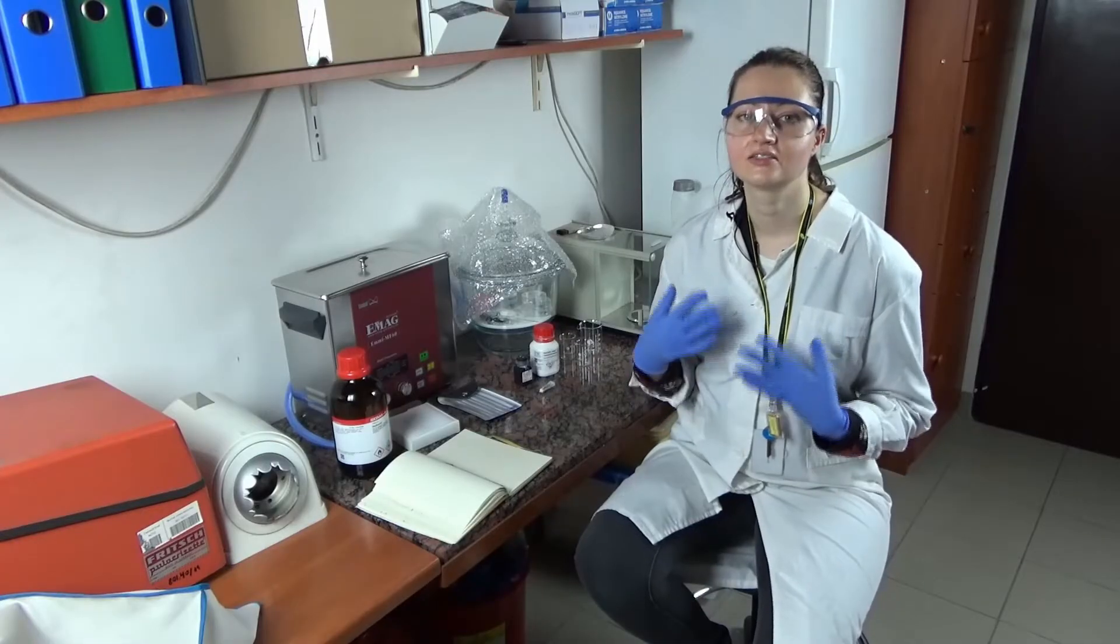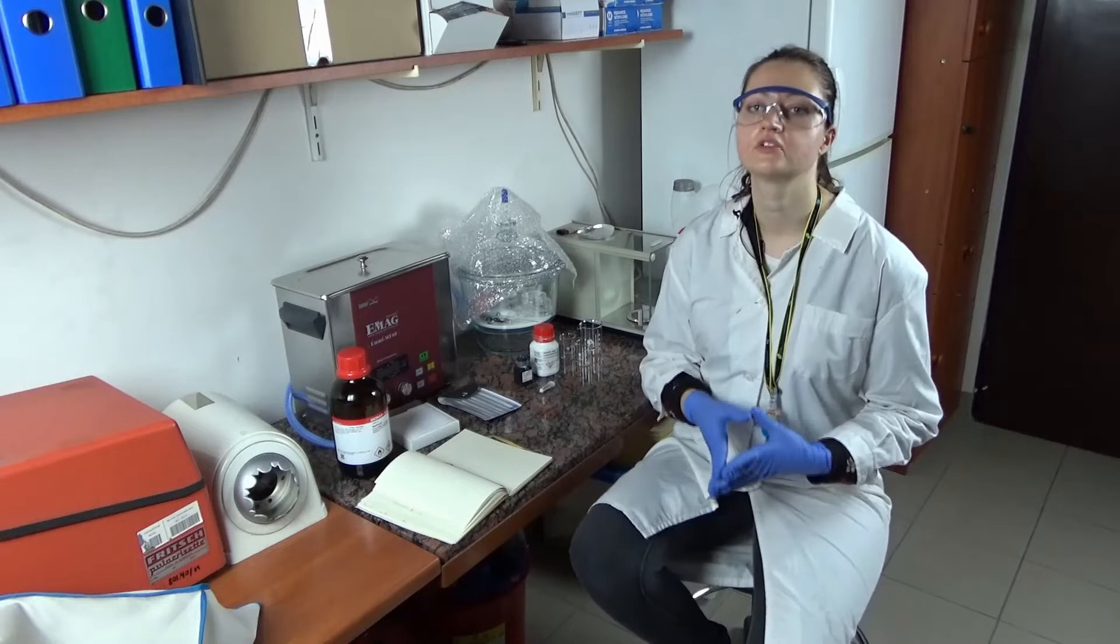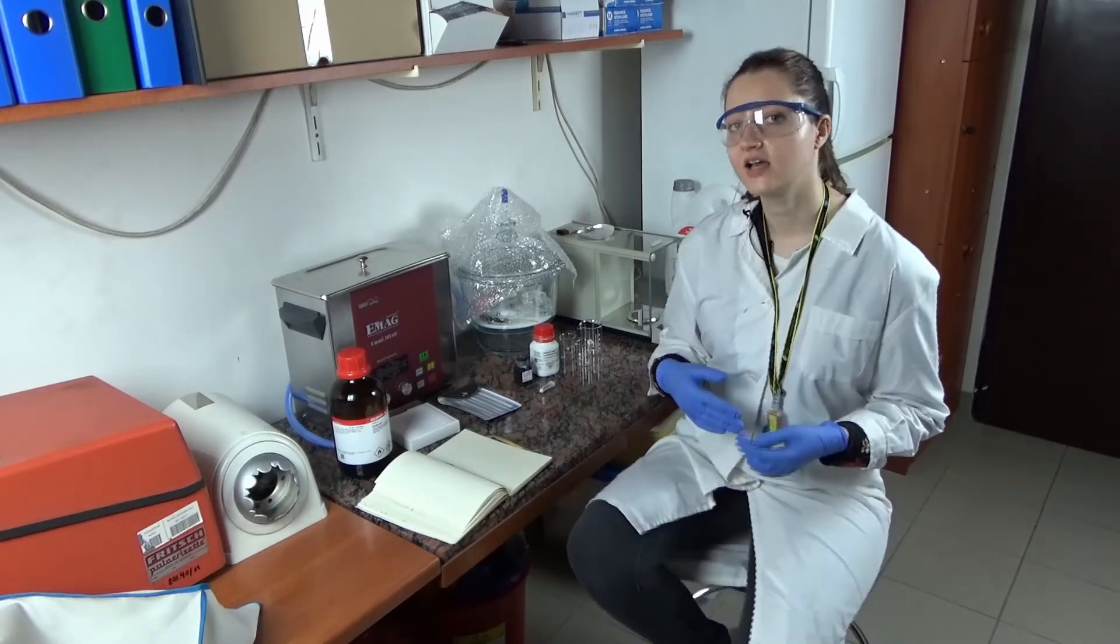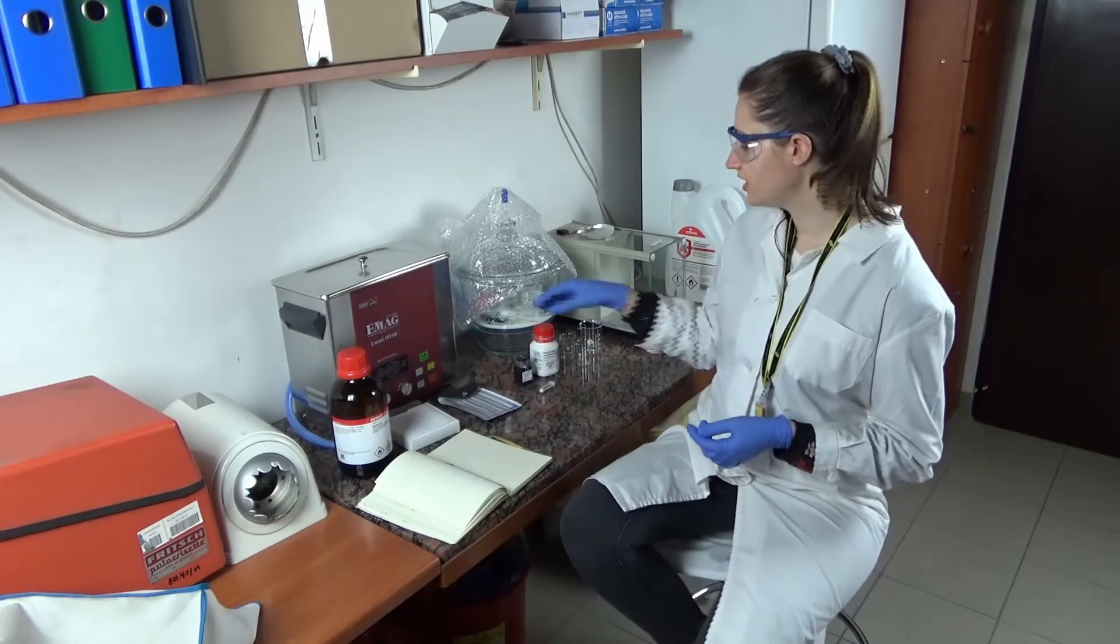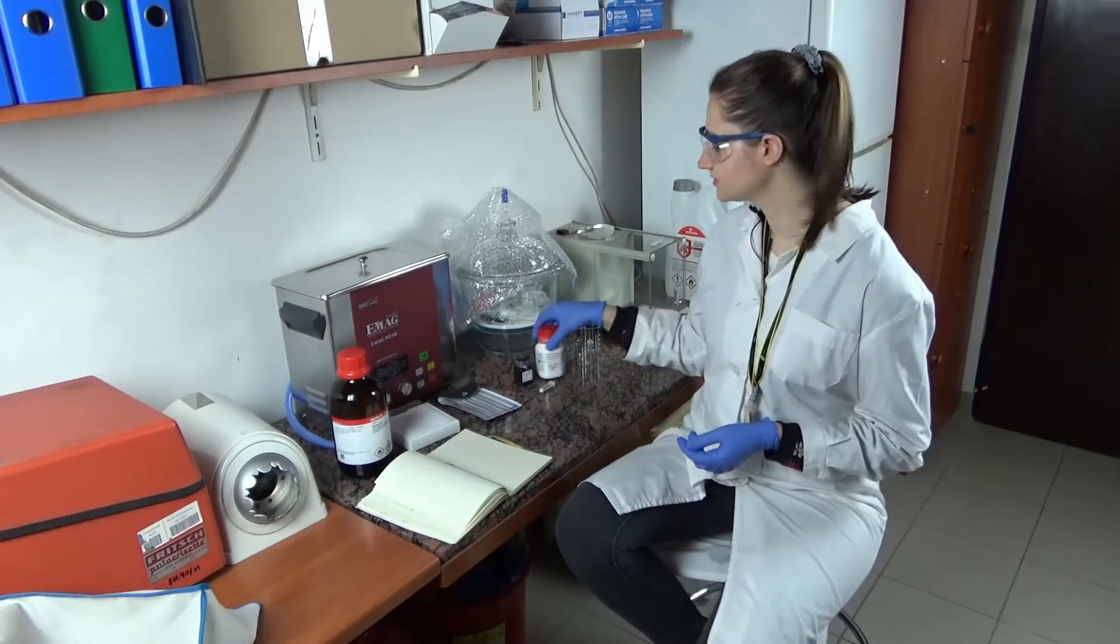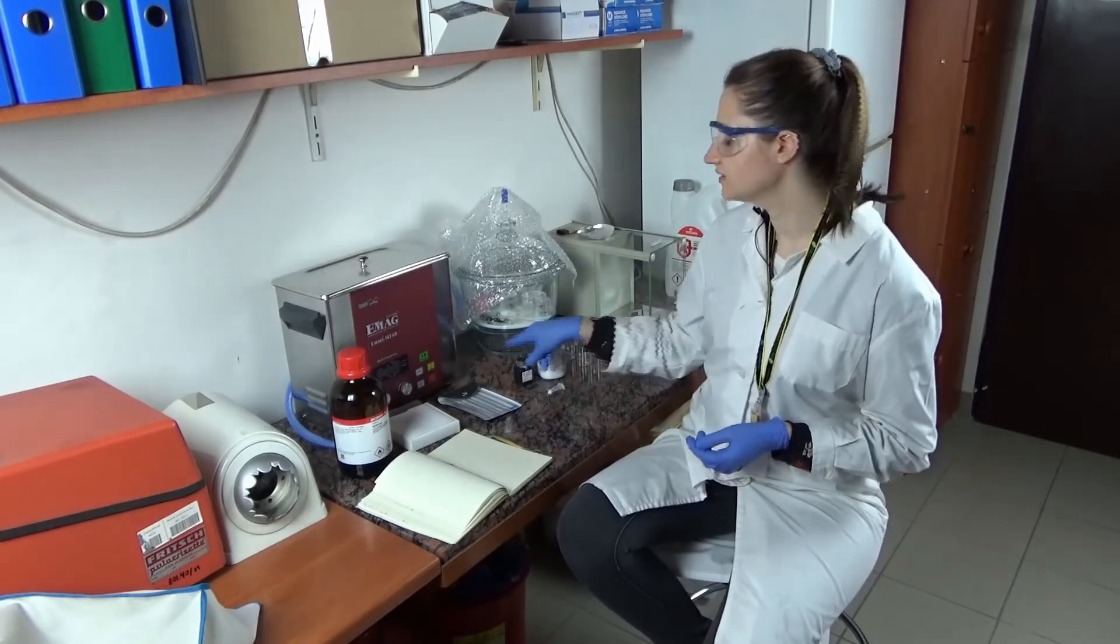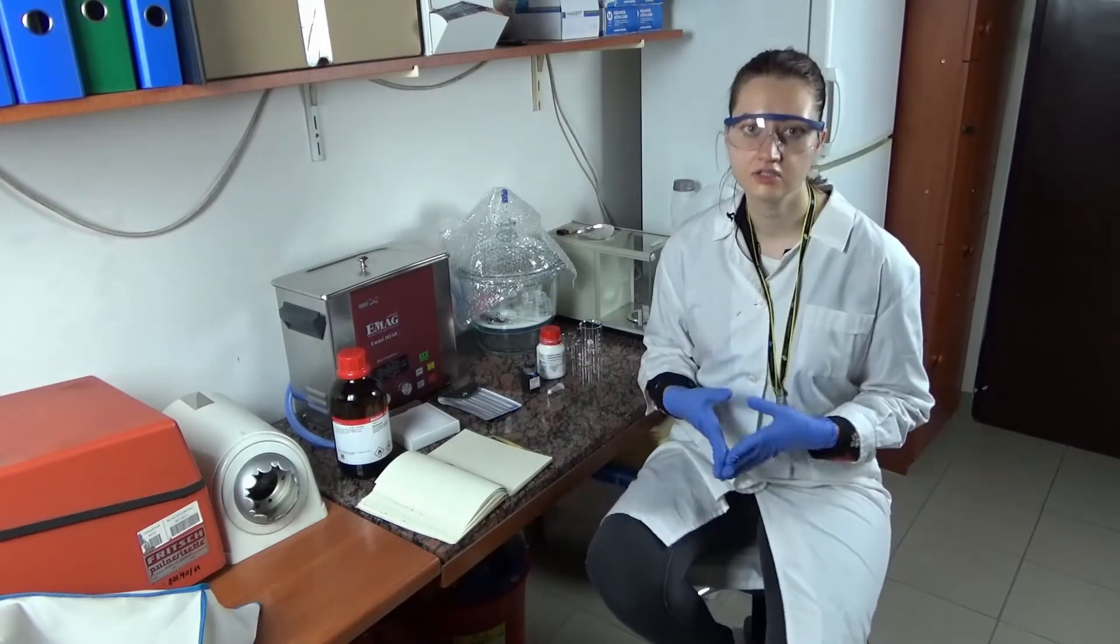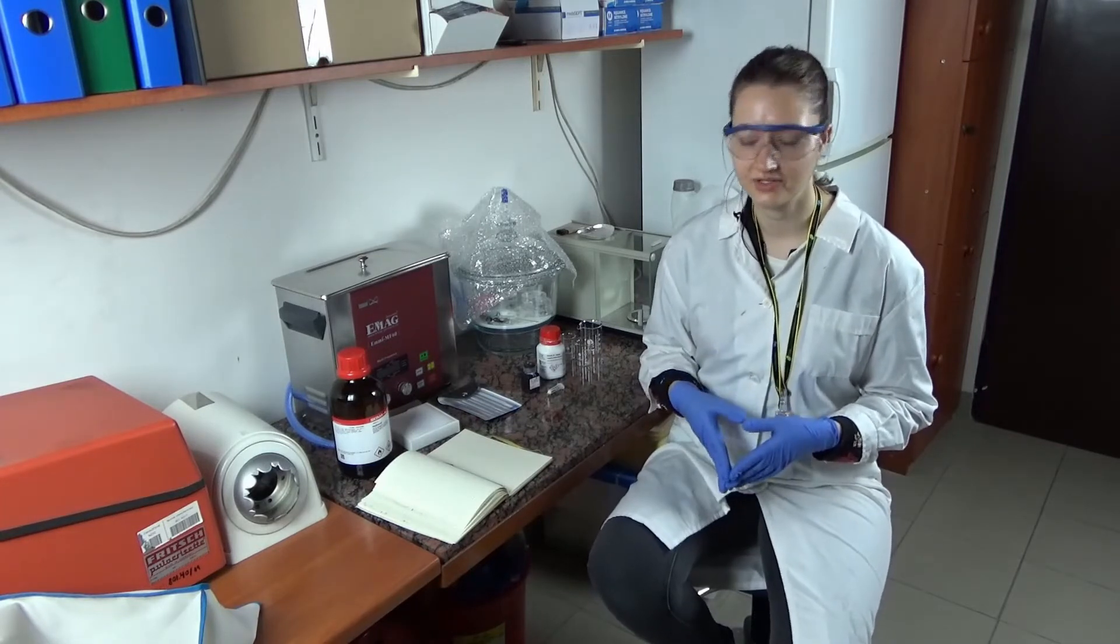As you probably guessed by yourself, the first step of each synthesis is proper weighing of all of the compounds. I've got here three compounds: first, copper chloride; second, triazole; and third, phenanthroline. You have to weigh each of the compounds carefully to not affect the final product.